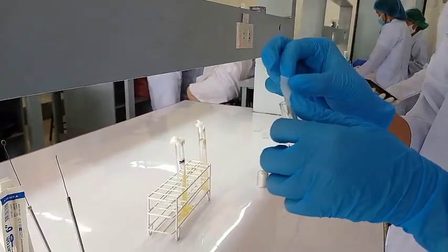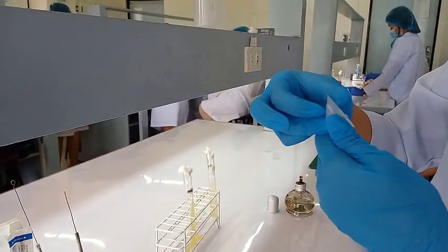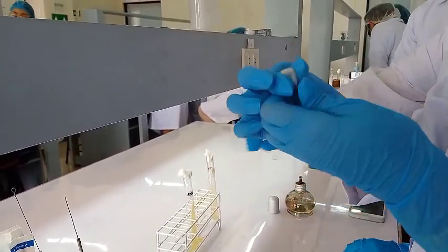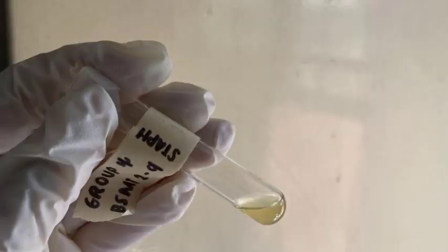After that, incubate for 4 hours at 35 degrees Celsius. Then observe for coagulation formation. If there is no coagulation, incubate further up to 18 hours. Here are the results after 4 hours. It was noted that there was a coagulation formation. Although it is not evident in the image, it was positive for coagulation formation in person.